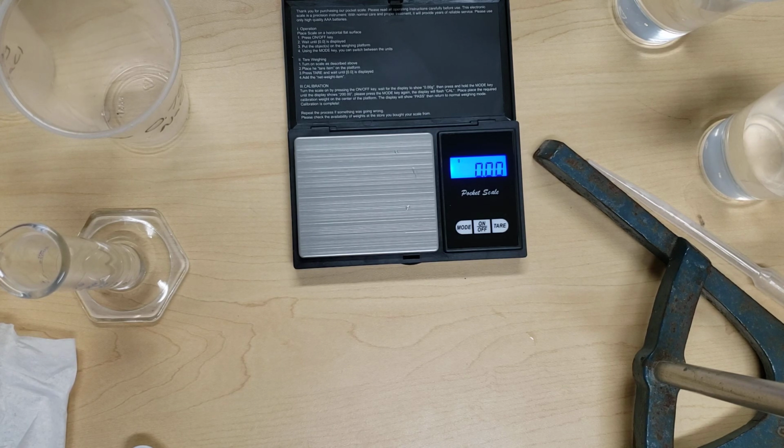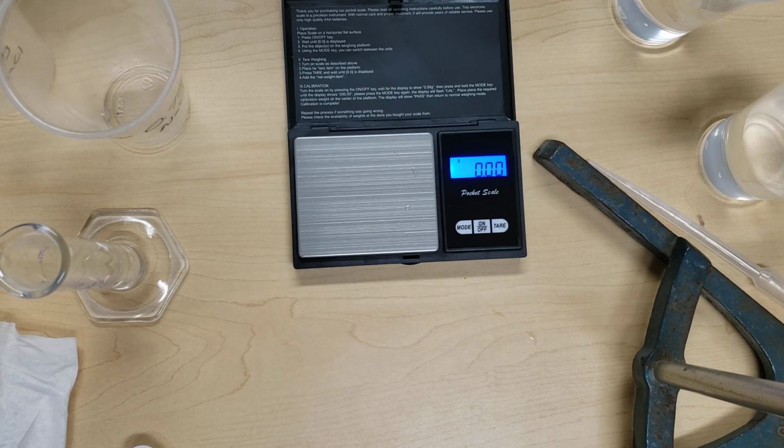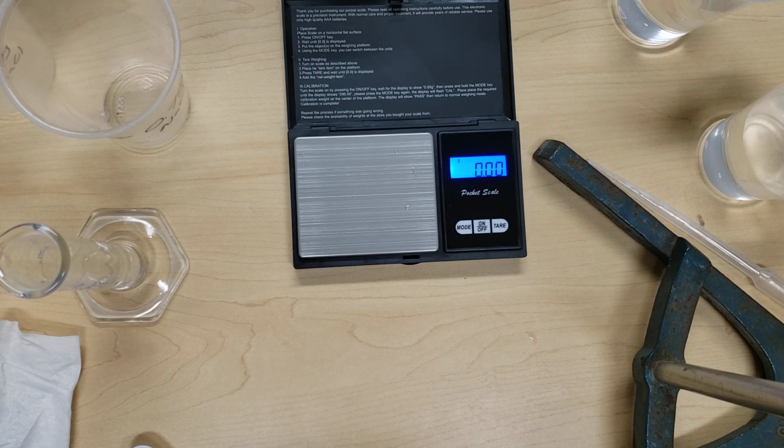To clean up after you're done, all of the salt water can go down the drain. The sand and filter paper can be put into the garbage. Also, make sure that you are wearing your safety goggles through this entire procedure. If at any point you have any questions about how to carry out this procedure, please don't hesitate to reach out.